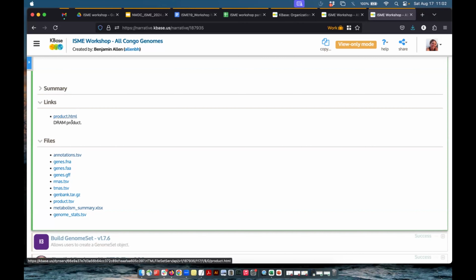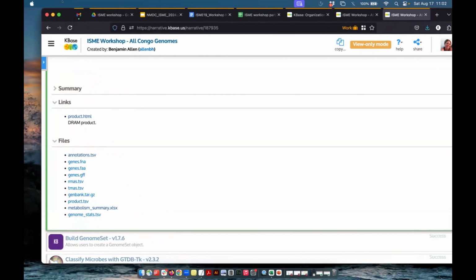You can download it from here. And sometimes I prefer to look at the product in a TSV format, opening it in Excel so I can sort by true or false on specific functions. So that is there as well if you want it. Okay, so Alicia opened these files for us.